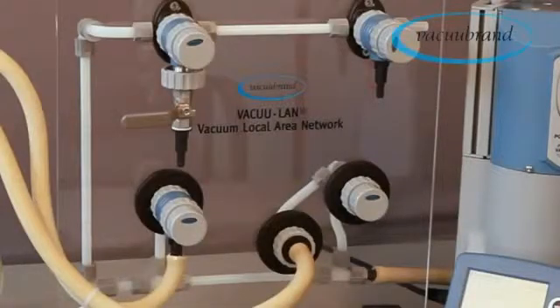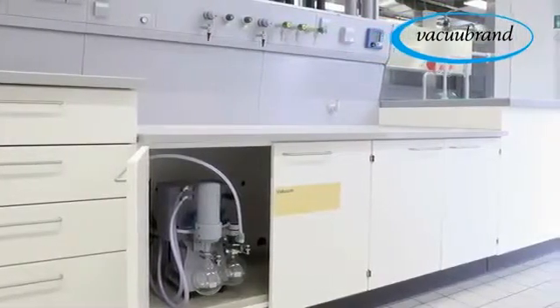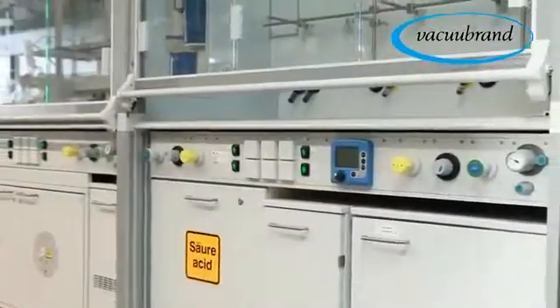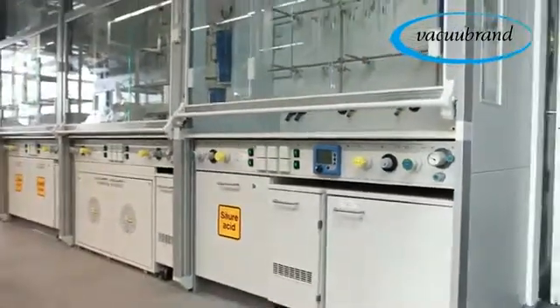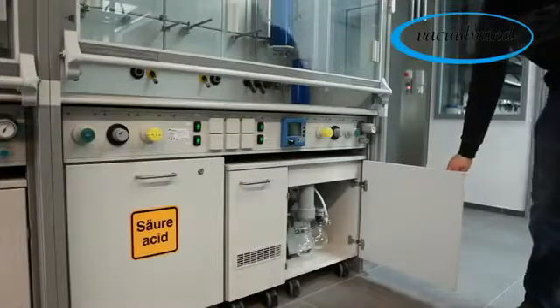VacuLan — thousands of users in laboratories around the world. VacuLan, the modern and economical alternative to central vacuum systems.